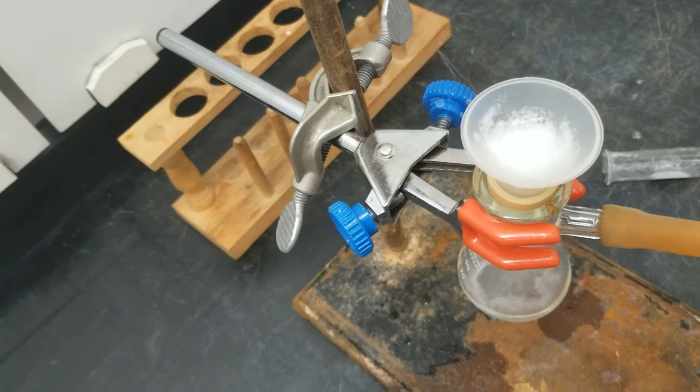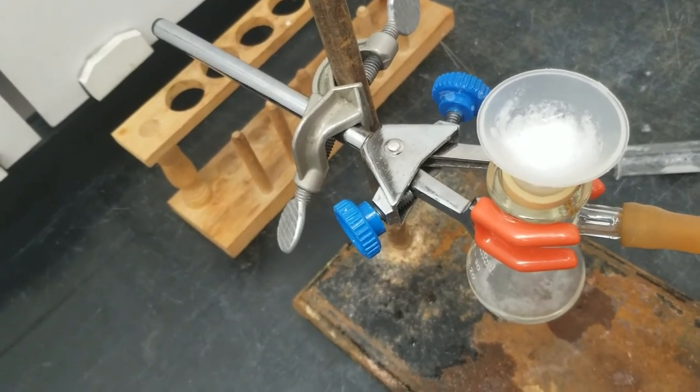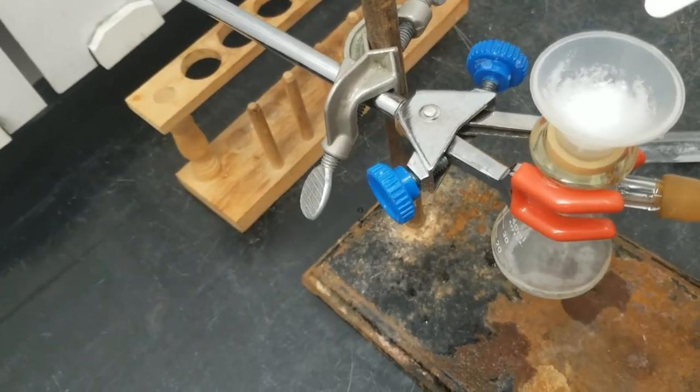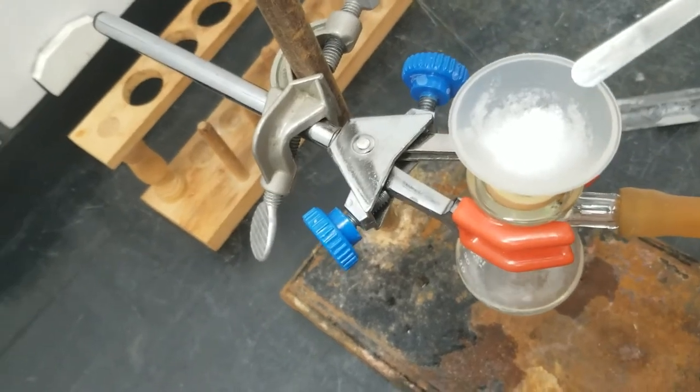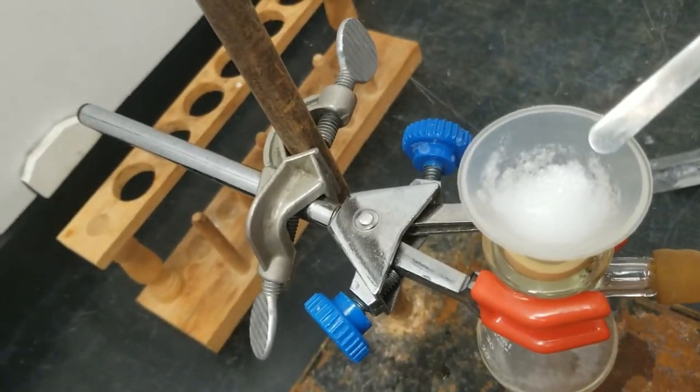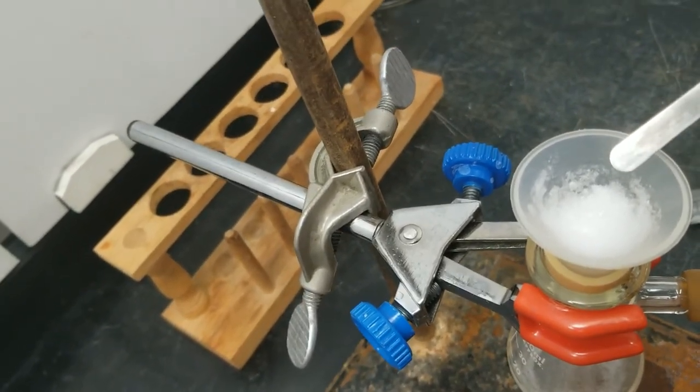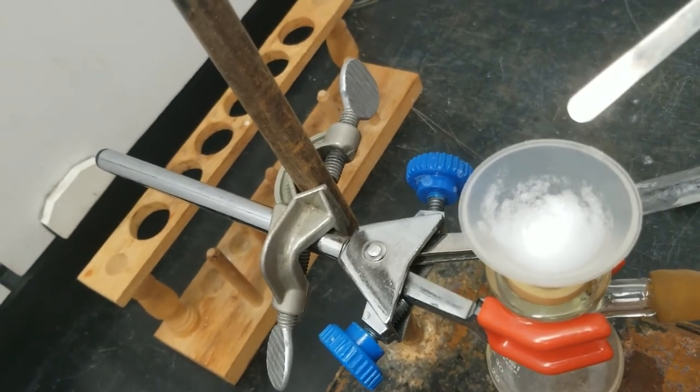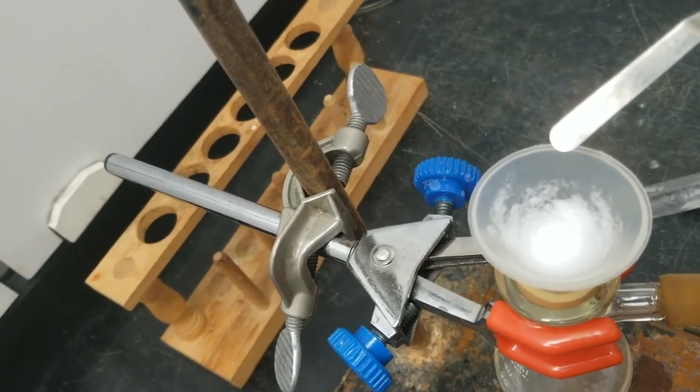And you can see that the liquid is being pulled through and is dripping down into the collection flask. And we're being left with a fairly white, shiny, crystalline product up top. And that is our alcohol product called 1,1-diphenyl methanol.